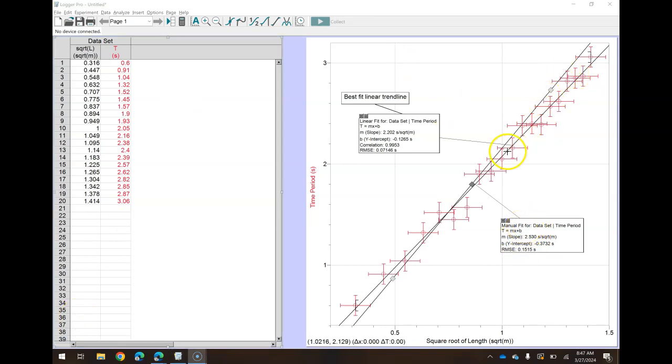Now these lines look very similar, and these boxes are going to get confusing, so I'm going to insert text annotation.